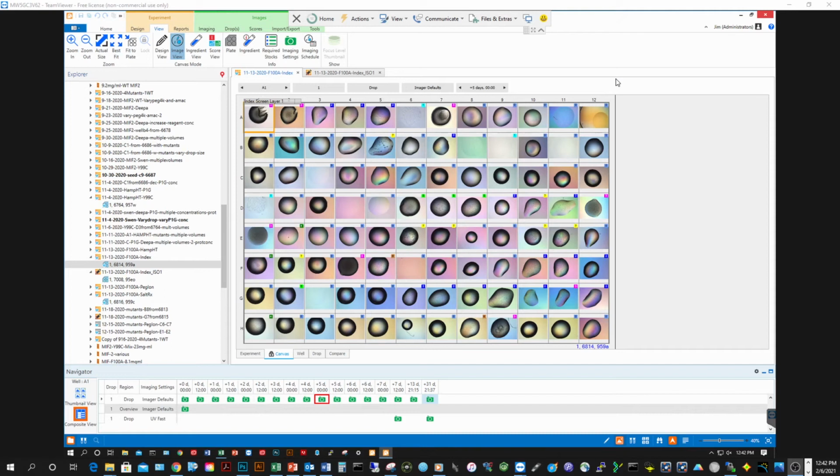In the past, an initial screen with no crystal hits was not considered very useful, but there is data in the wells that do not have crystals there which can be utilized in an ISO process. ISO will allow us to move the crystallization environment towards a metastable supersaturated state where, although actual crystallization conditions cannot be determined prior, a cycle of scoring and screen improvements can be successful.